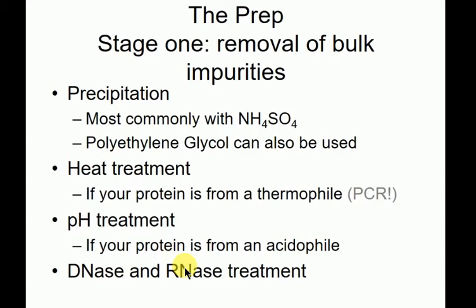RNase, right? RNase is everywhere. If any of you work on RNA, you'll know this. RNase is just everywhere, so maybe you don't need to use RNases. DNases are more important.